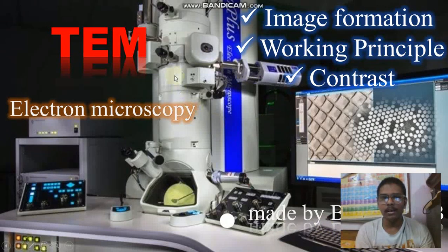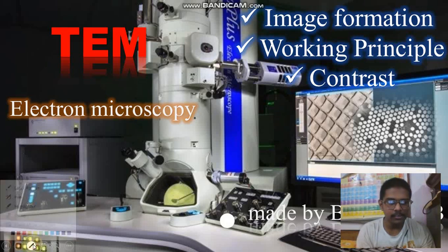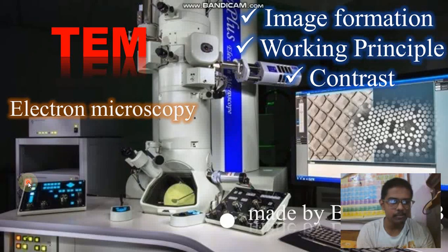Here, as you can see, this is an image of a microscope. In the upper part of the microscope there is an electron gun which creates high energy electrons, let's say, as we will see in the next slide, 100 kilo electron volt, which has a high energy and thus can create a high speed of electrons. Then they interact with your matter, produce three types of scattering, and make an image. We will see that in this video.